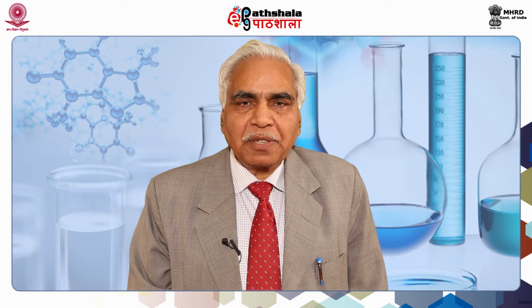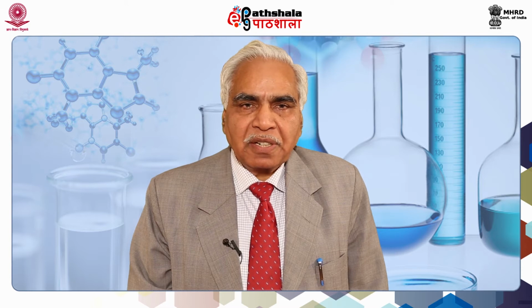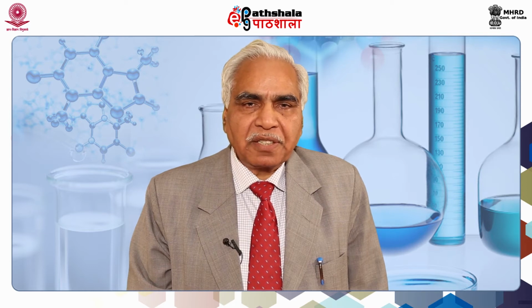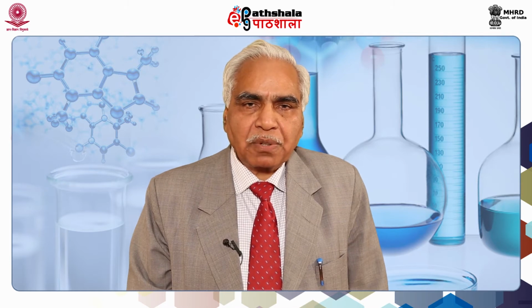Today, I will be teaching you capillary gel electrophoresis. Capillary gel electrophoresis is different from many other electrophoretic techniques. That is, it is different from the agar gel electrophoresis, it is different from polyacrylamide gel electrophoresis, and also different from the isoelectric focusing. It has many features which are not present in other electrophoretic techniques.